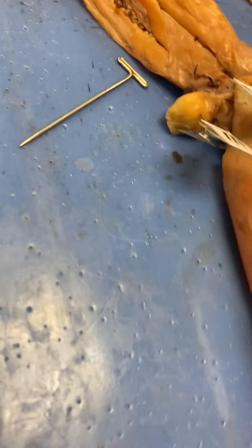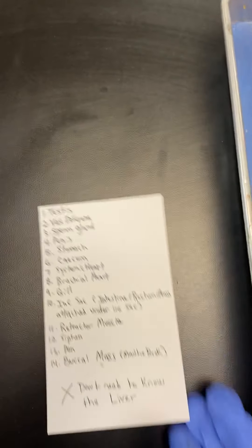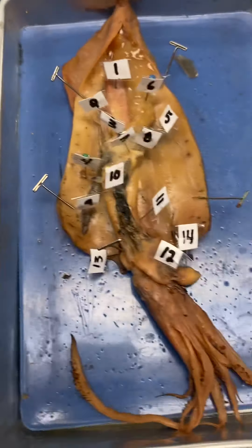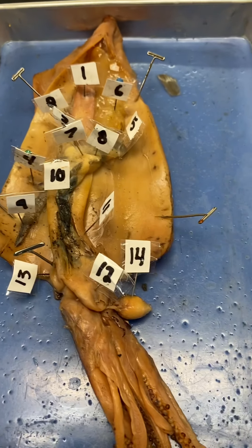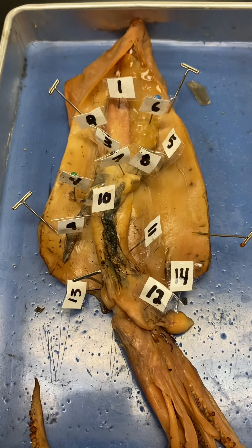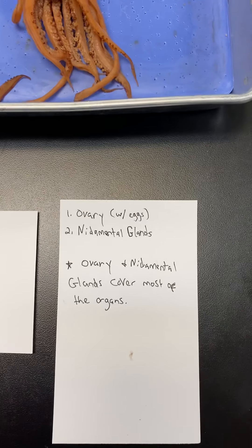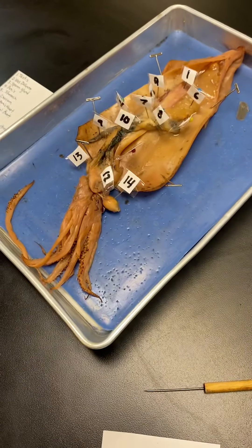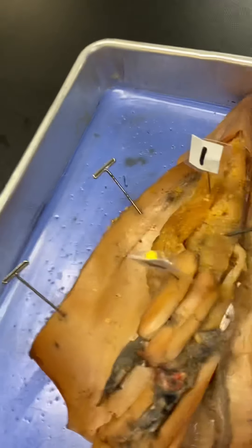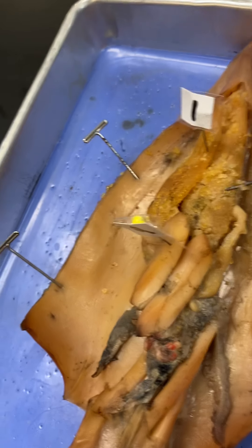You have your arms — the shorter ones; there are eight of them — and they have suckers on them. The longer ones are the tentacles, which also have suckers. One of the tentacles I think got ripped off in this one. The upper body of the squid — looking at it on the inside — this is the mantle, and then we have the fins. All the little purple dots on the mantle are the chromatophores.